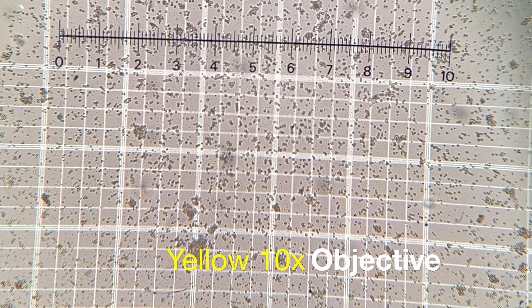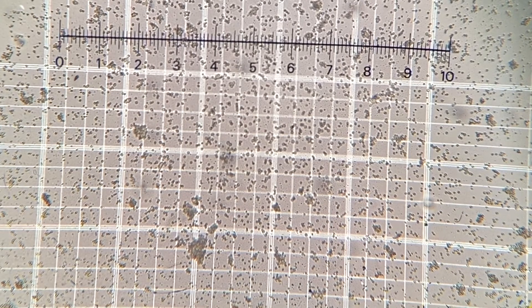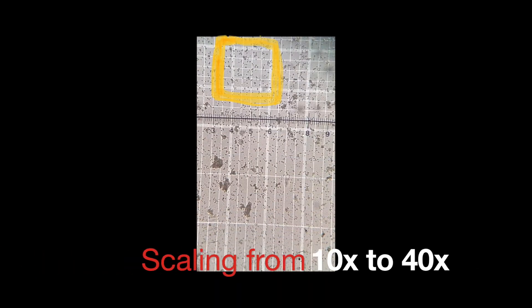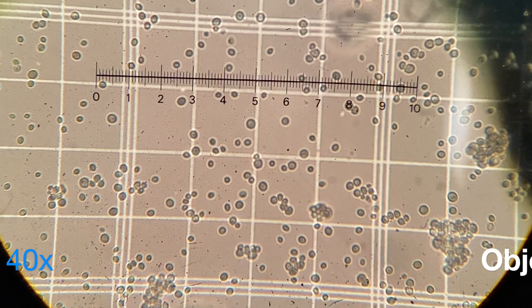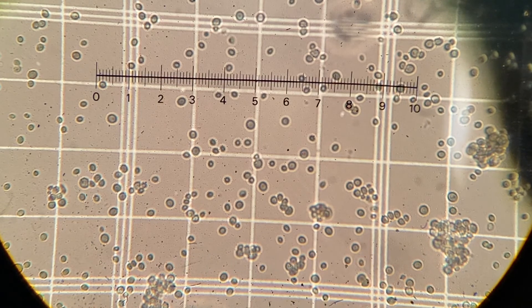This is a microscope view of the yeast sample on the hemocytometer. The objective used in this case is the 10x magnification. Squares indicated by the yellow box using the 10x magnification objective become almost the entire field of view in the next slide using the 40x magnification objective.